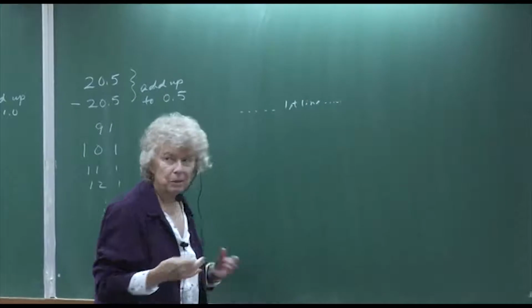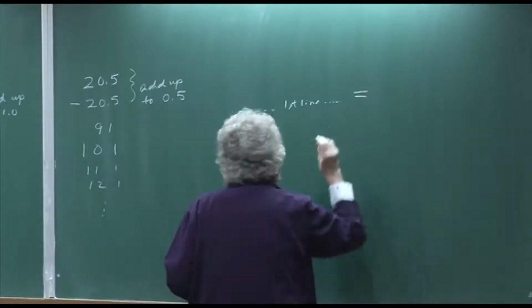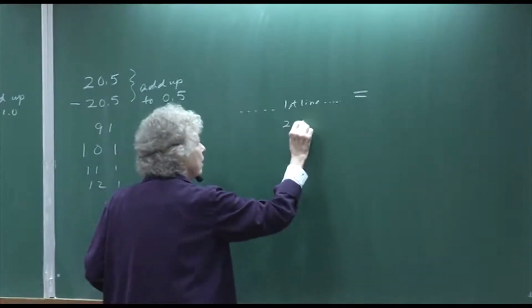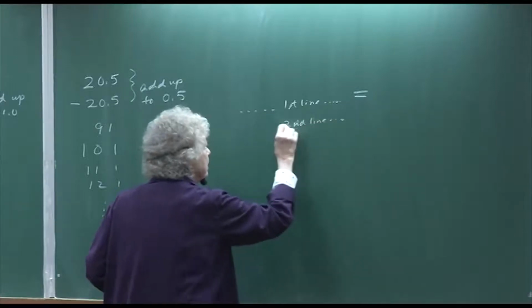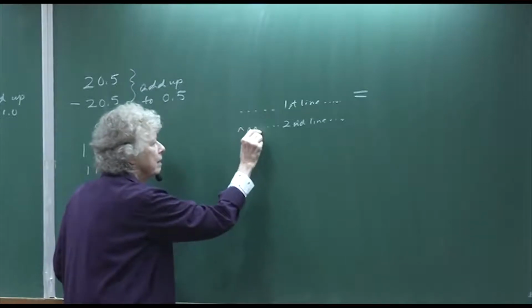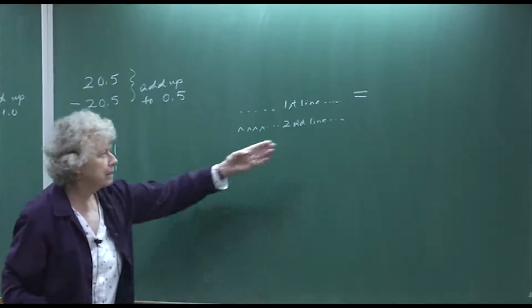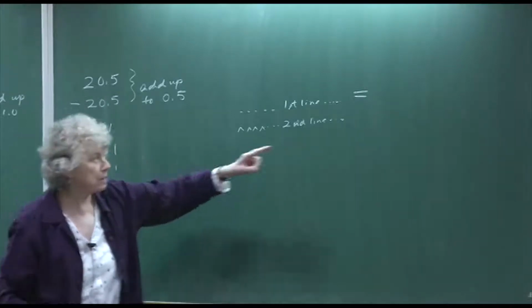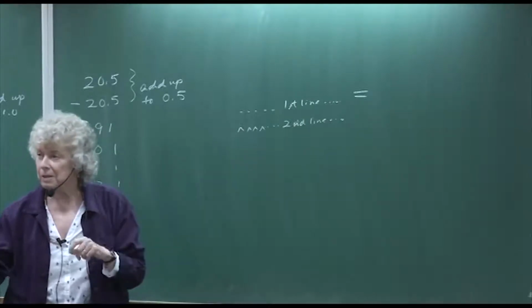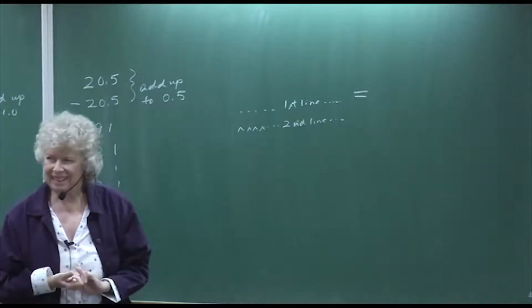And then you start to get too long of a line because you're violating the 80-column thing. You can just put an equal sign there. And then the second line continues. I usually put 4 spaces at the beginning of the second line, just to make sure that the syntax is right. But you can just continue. You can always do that. It's just the equal sign is just a continuation, like when you have the anisotropic thermal ellipsoids, you know there's always an equal sign at the end. So that's continue, okay?